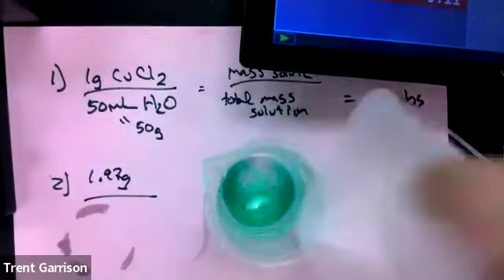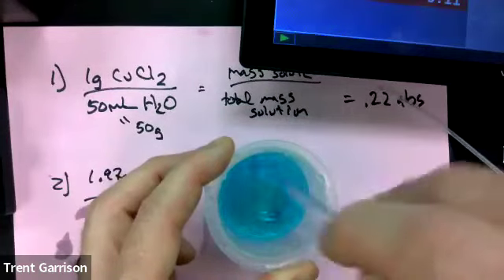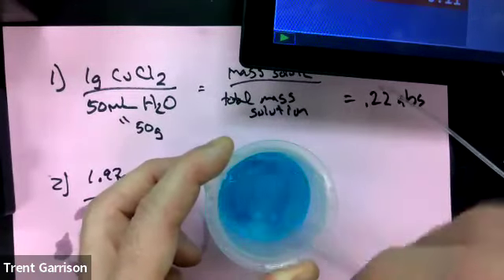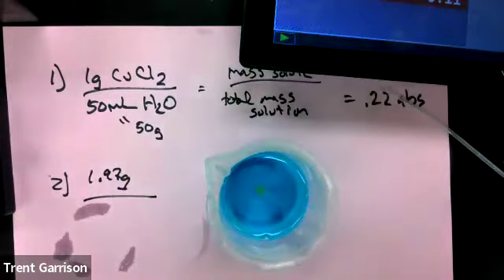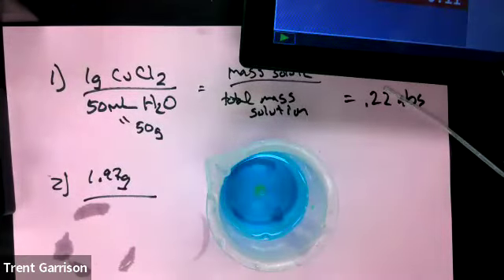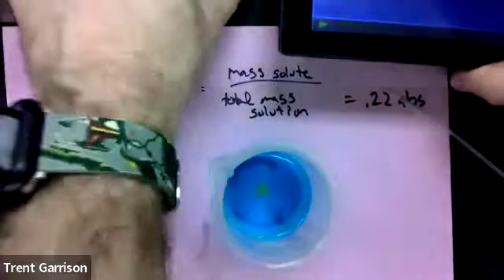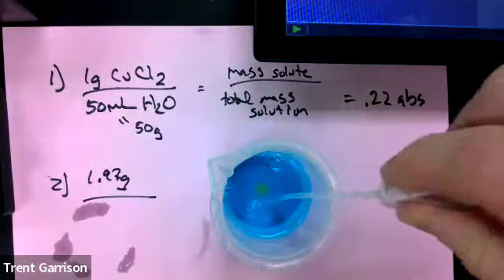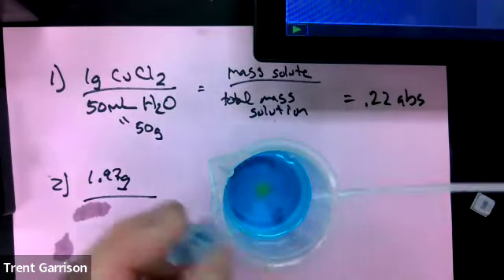We know it's soluble. We know it will dissolve. We hope that what we see is a little bit darker solution. And we already know from Beer's law that what we're seeing is this parallel direct relationship. We'll see how direct it is. So I've got now my second solution, and I've got my second cuvette. So I'm now going to suck up some amount of this and put it into this cuvette.